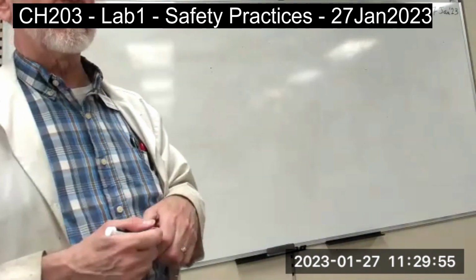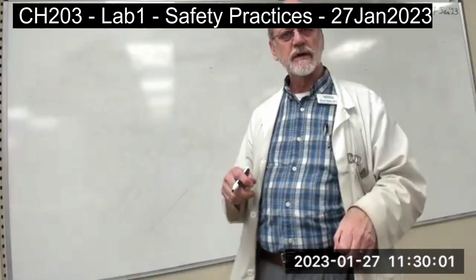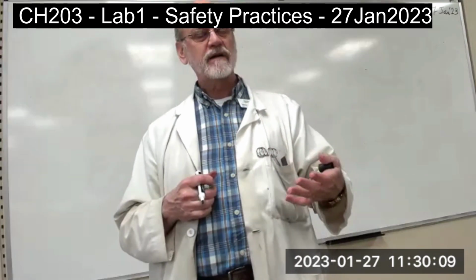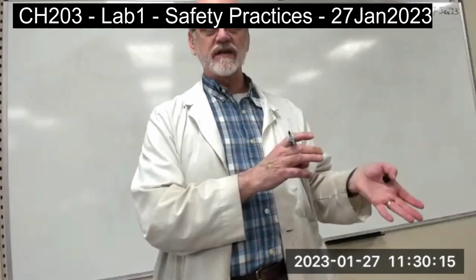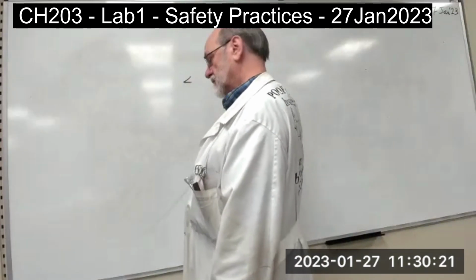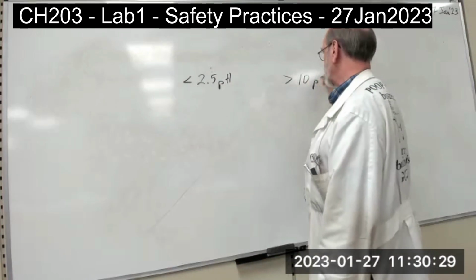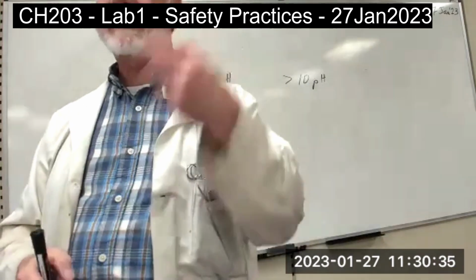Now, I think it's OSHA that has definitions for caustic materials. We haven't talked about pH yet, but have you had pH in any of your other classes? It's an expression of acidity, right? The lower the pH value, the more acidic it is. The higher the pH value, the more caustic it is. And in general, anything less than, I think it's 2.5 pH or greater than 10 pH is considered caustic. It can potentially burn your skin or cause eye damage.